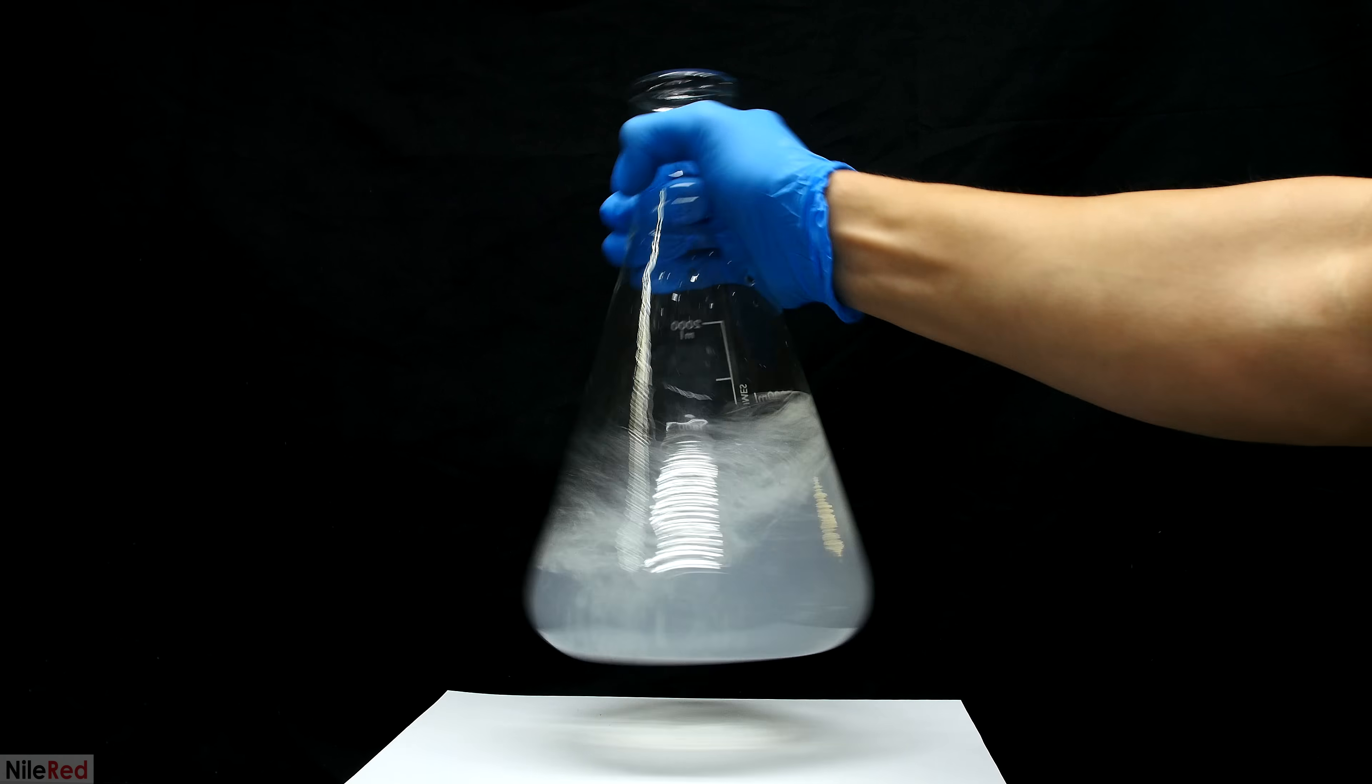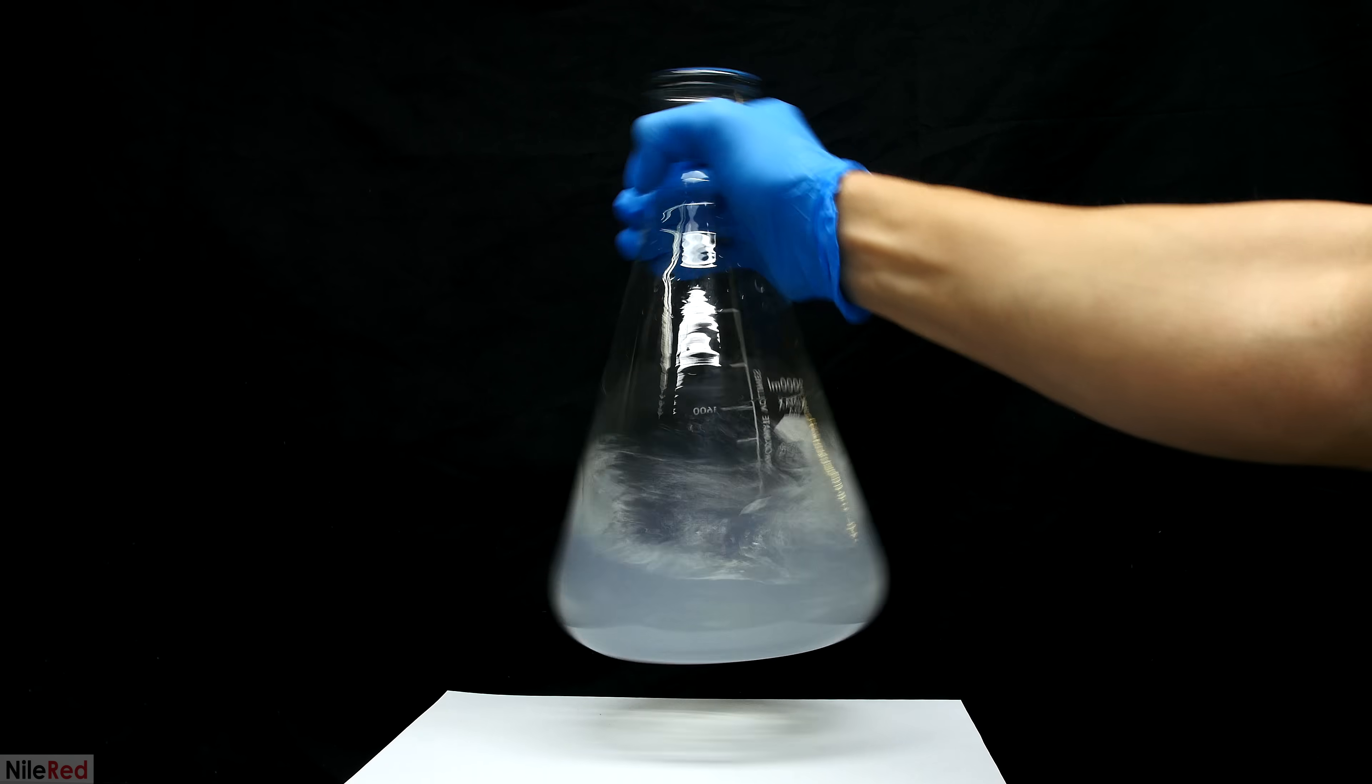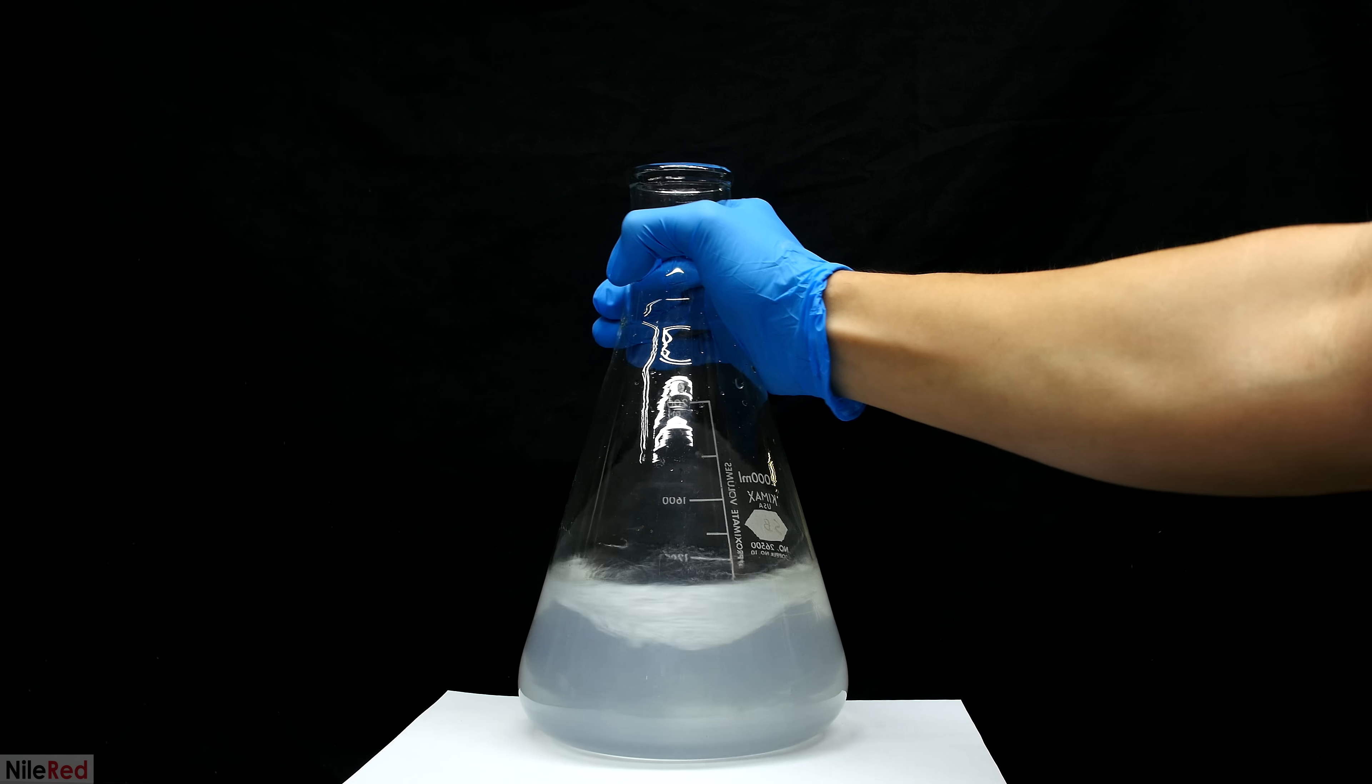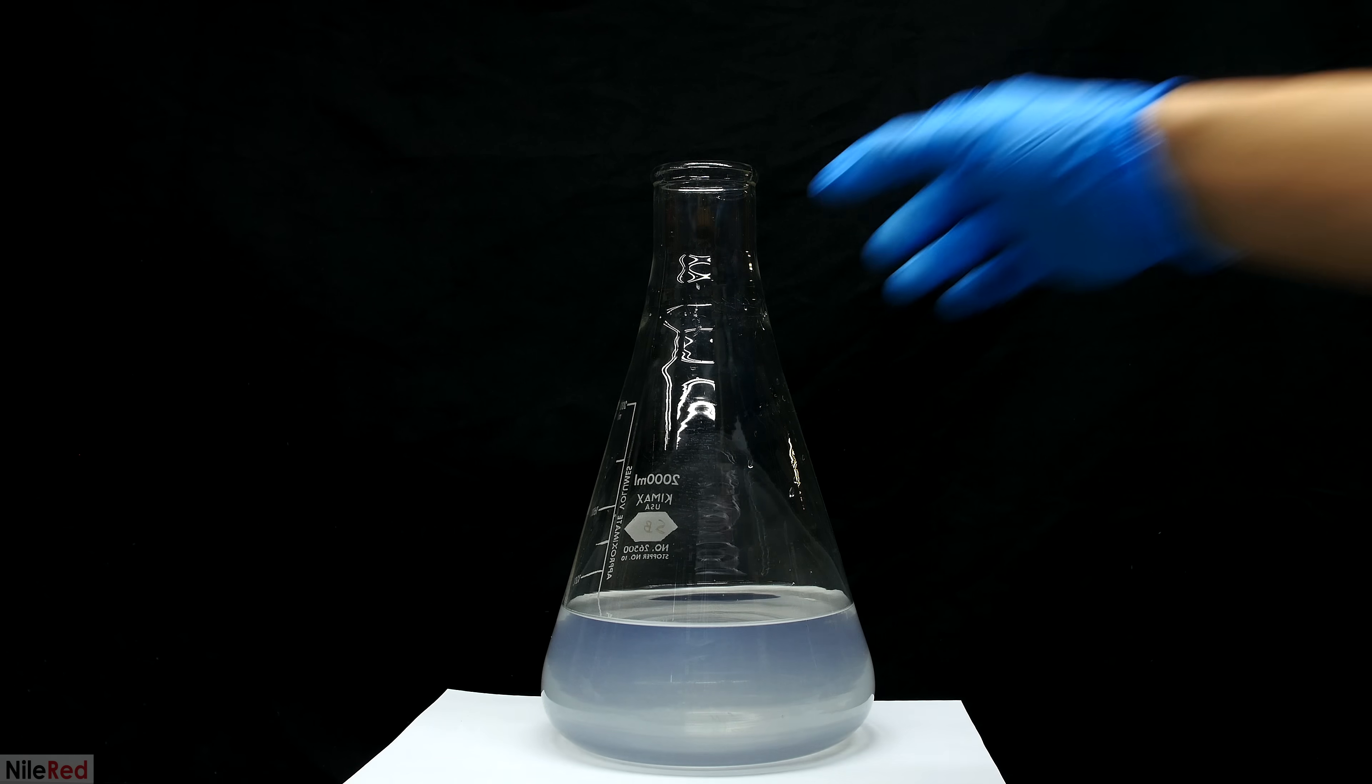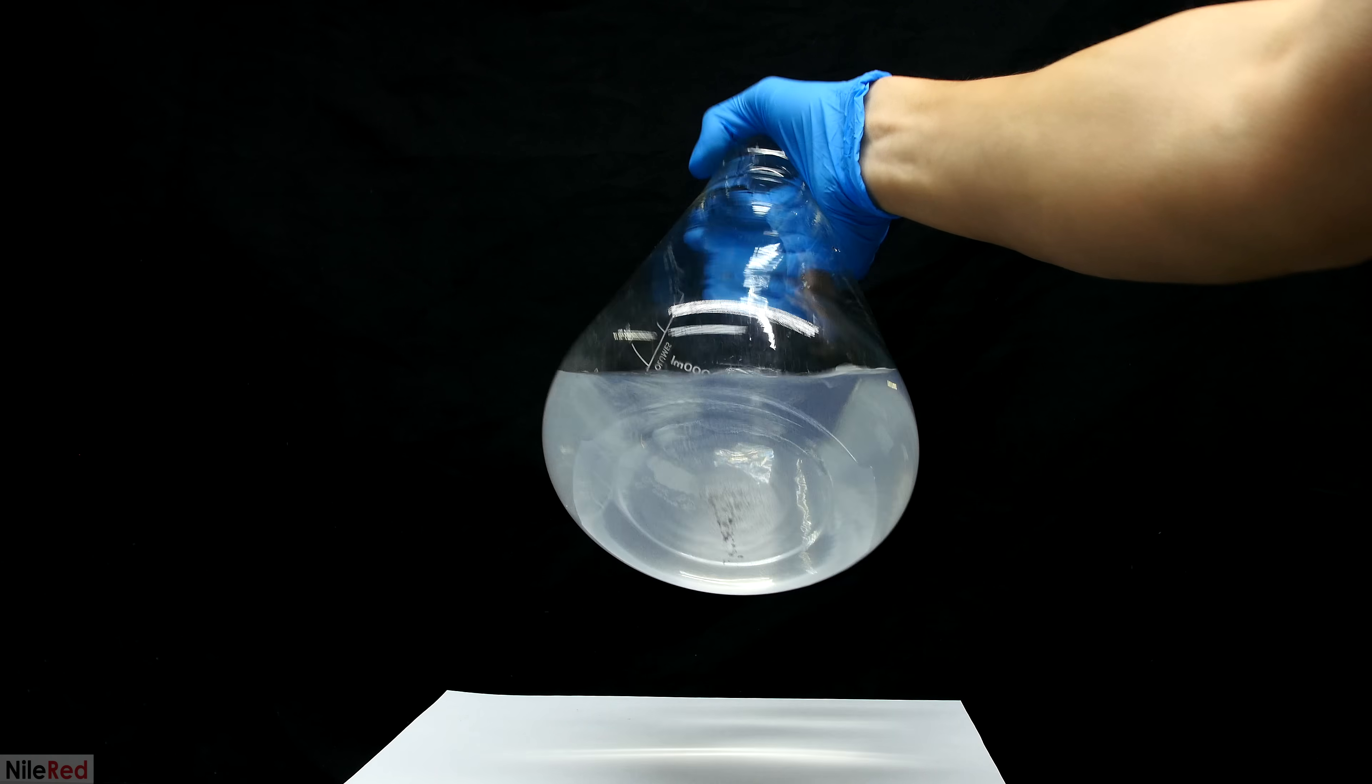On a serious note, silver nitrate tends to decompose back into metallic silver, and this is probably what's floating around. After letting it settle for a bit, I take a look at the bottom, and we can actually see some silver there.